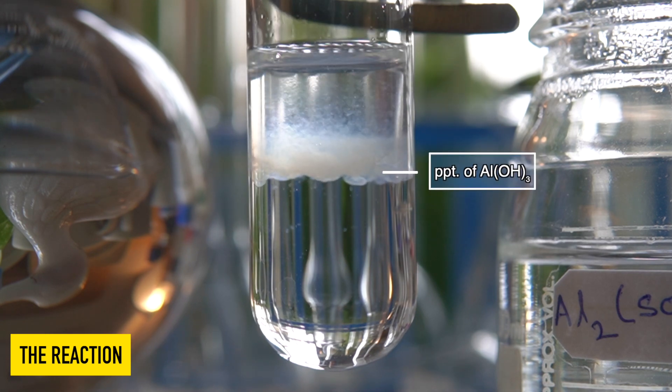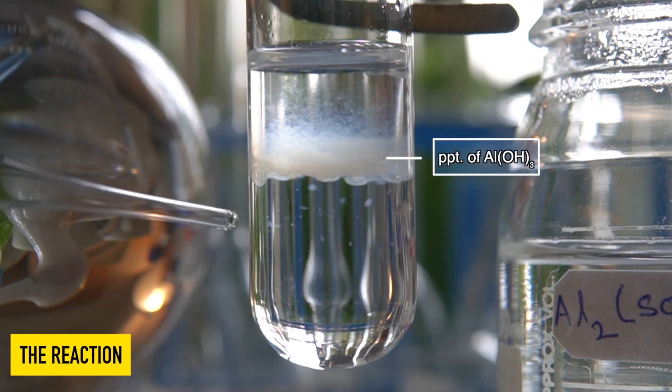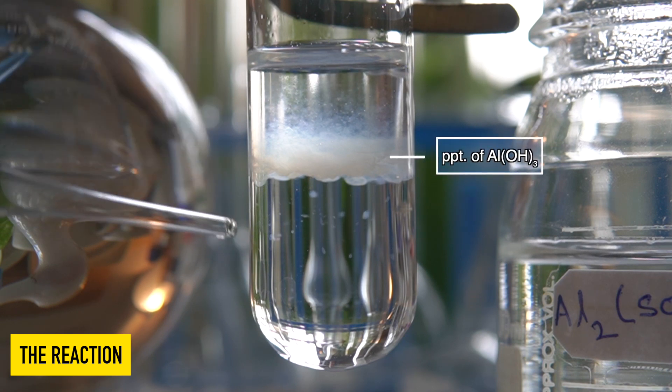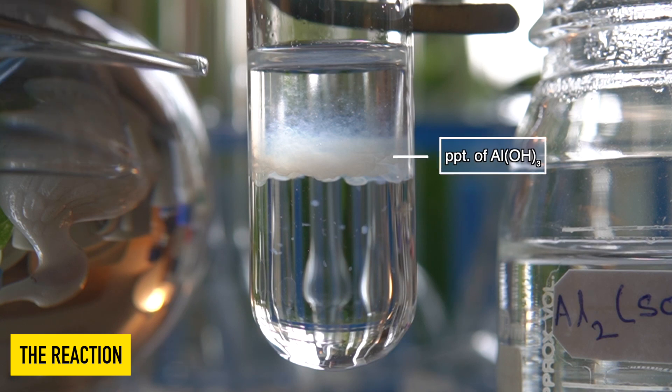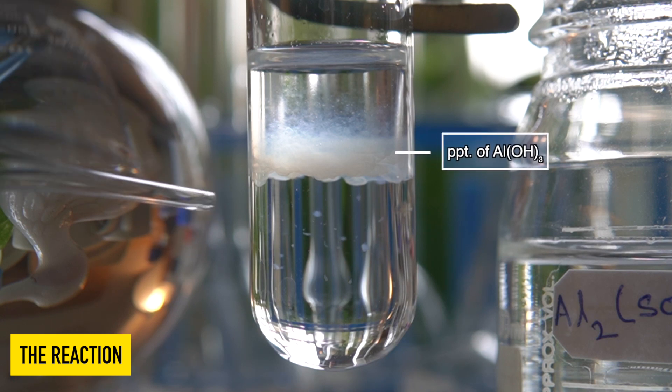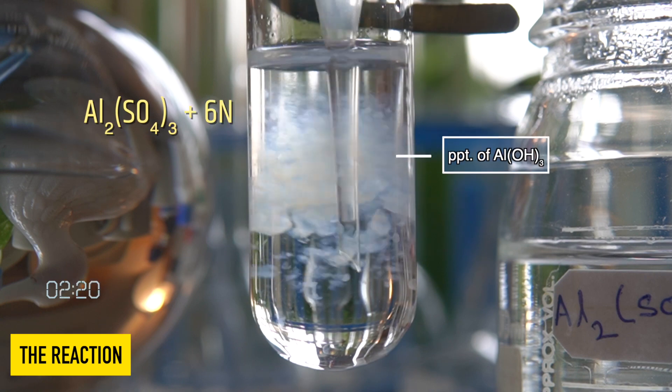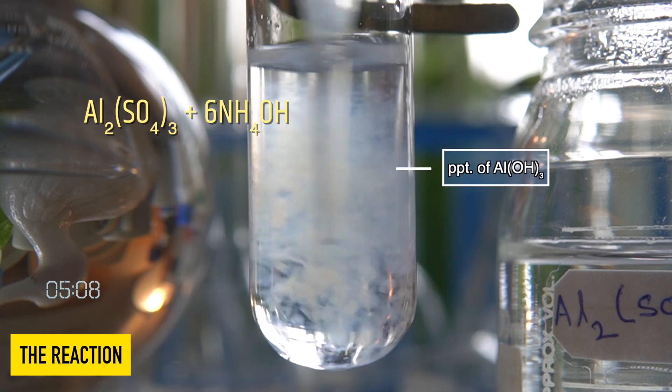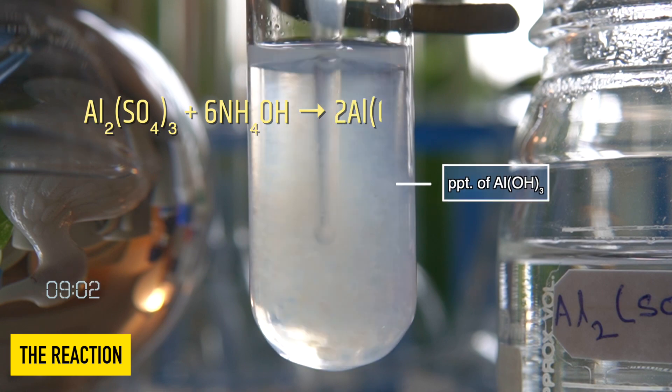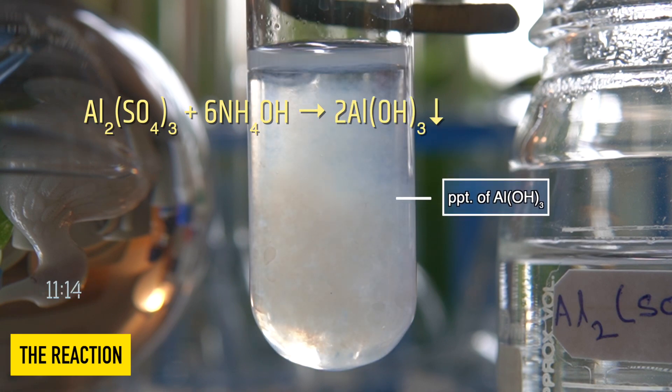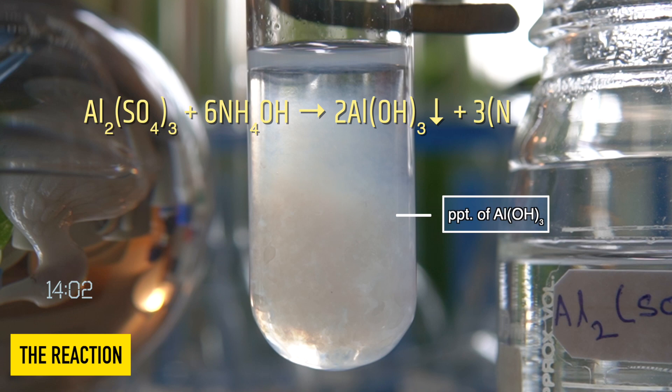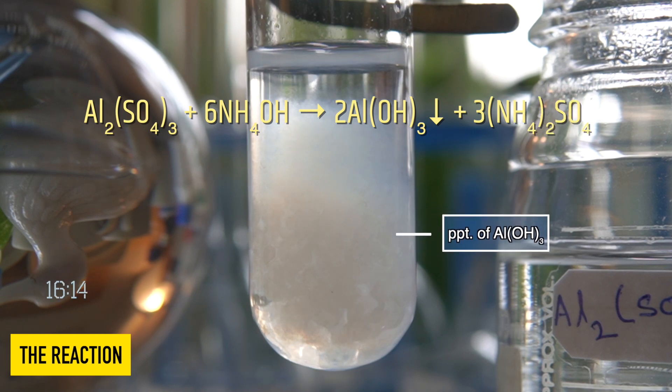The gelatinous white precipitate that has been formed inside the test tube is nothing but aluminium hydroxide. In this reaction, aqueous solution of aluminium sulphate reacts with ammonium hydroxide to produce a gelatinous precipitate of aluminium hydroxide along with ammonium sulphate.